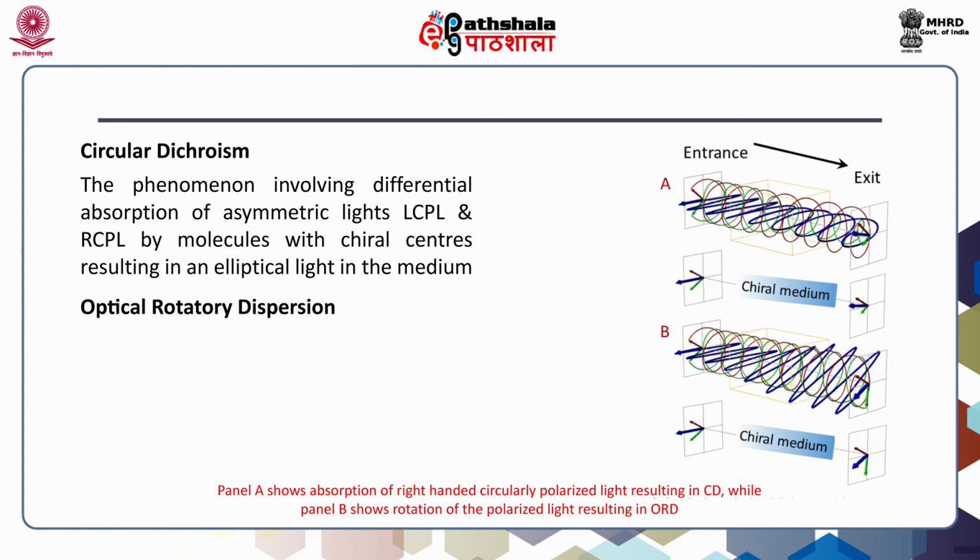You see that the component vectors are rotating in opposite directions, but the blue one is oscillating in only one direction, the horizontal. So it indicates that if you add left circularly polarized light and right circularly polarized light, they will provide you a linearly polarized light.